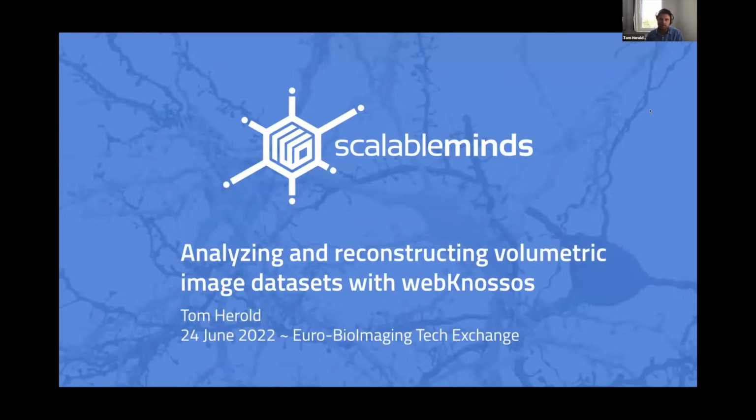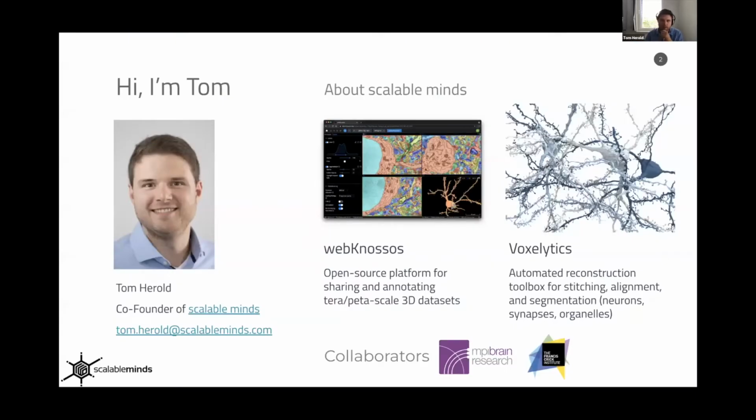I'm from scalableminds, and today I'd like to talk a little bit more about webKnossos and our software tools and solutions for working with volumetric datasets, in particular large-scale microscopy datasets, EM and the like. And as part of that, I would like to share a little bit of a case study later on, just to see how all of the offerings that we have fit together.